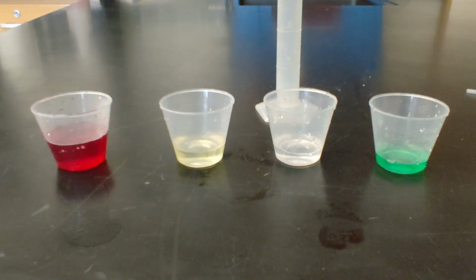This video is to go along with the Investigating Density Lab, and in this we will be looking at how different substances have different physical properties such as density. Density is the amount of matter in something, which we call the mass, compared to the volume, which is how much space they take up.